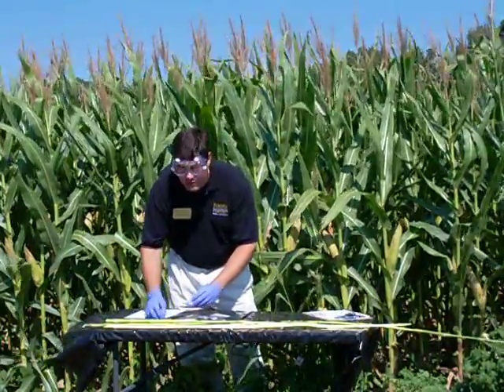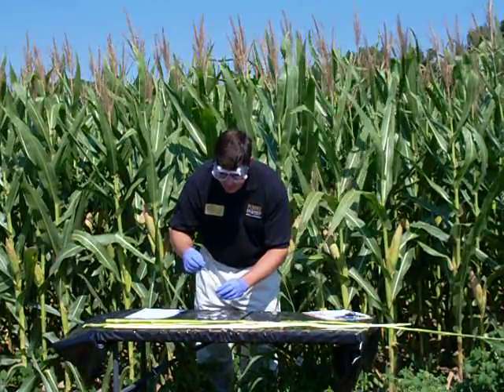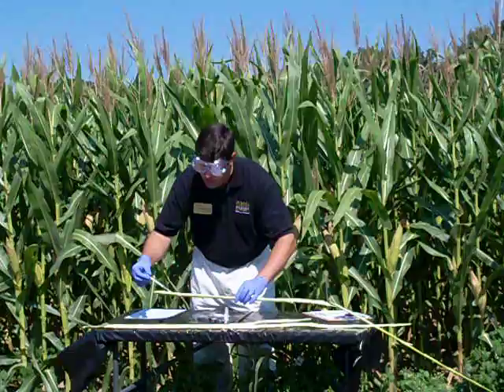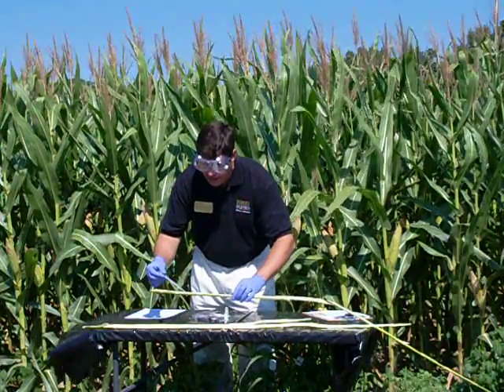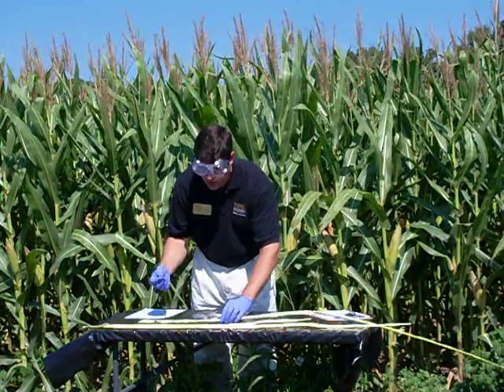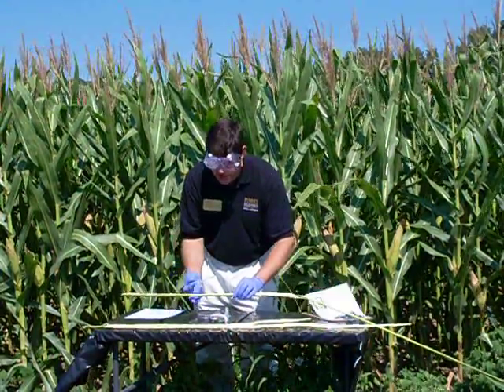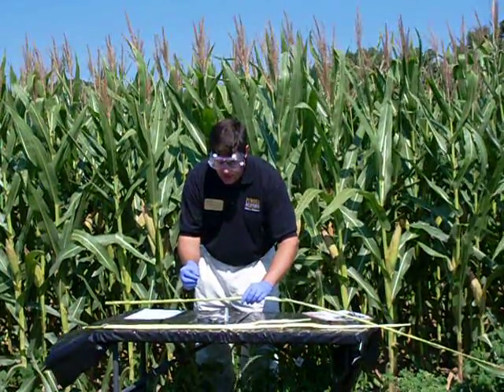For this test, we've split two different stalks from two different fields. We're going to apply sulfuric acid again to the stalk in between each of the nodes in the pith area and let it sit for roughly about a minute. After that minute, we'll be able to see what changes have taken place to that corn stalk as far as color goes, and then compare it against a chart developed by Purdue University and other universities to tell us where we may have concerns in these corn crops.